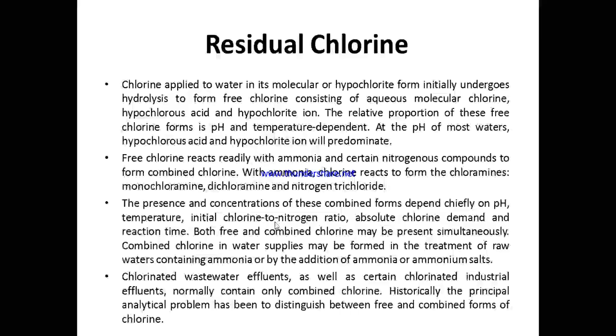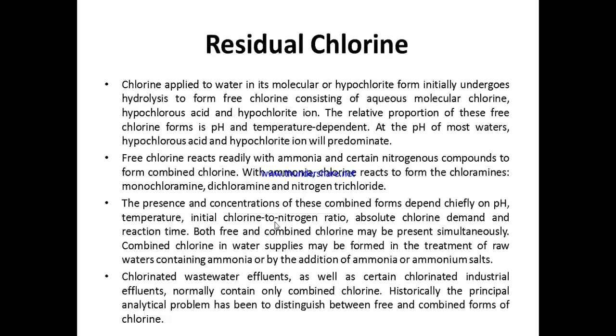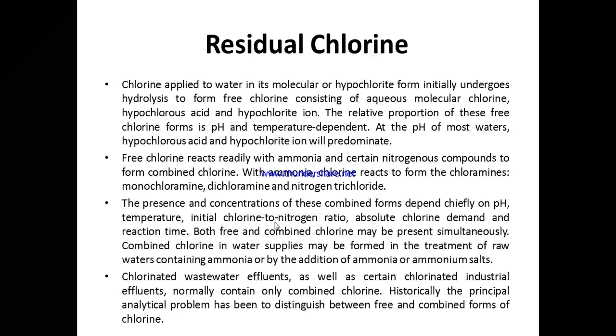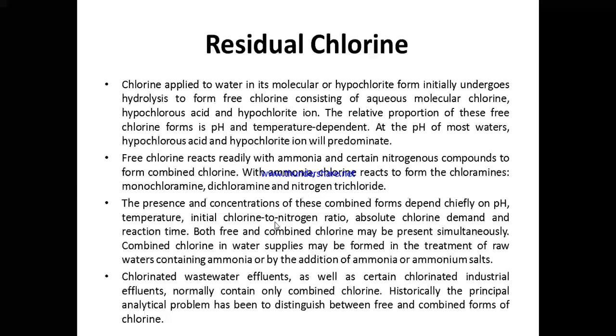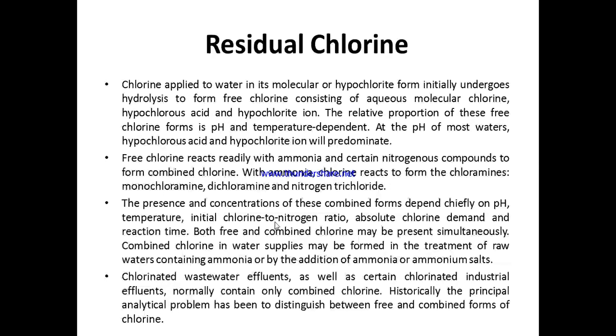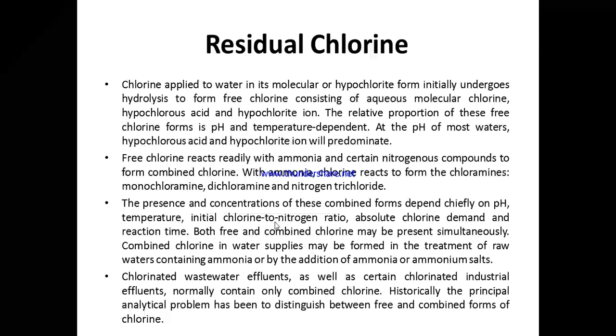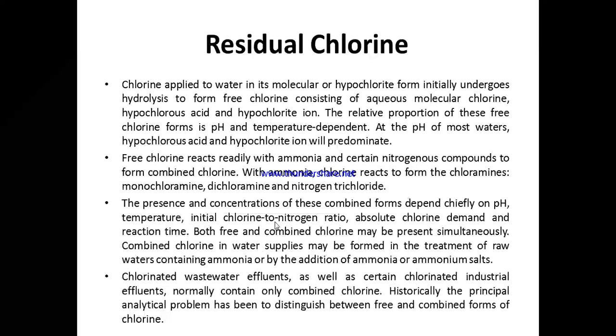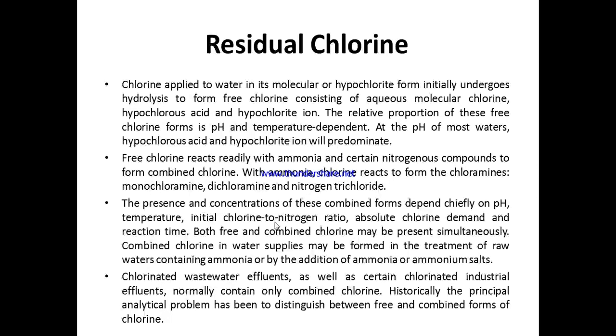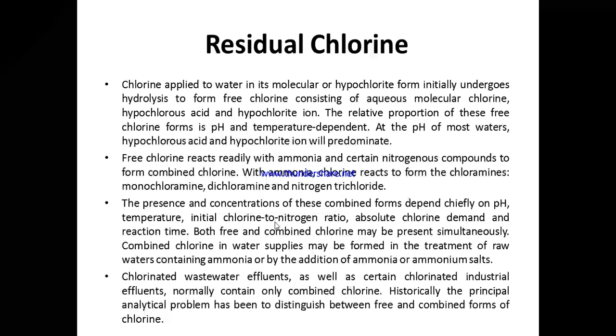So what I will do, I'll tell you the aim or the objective. I've told you already. Then I'll be telling you what is the underlying principle involved, what are the reagents that are involved. Okay, then I'll tell you the procedure, how it is done, and after that I'll show you the associated lab video that we have done for residual chlorine, and then we'll see the calculation steps, and then some interference or conclusion that can be drawn from the experiment.